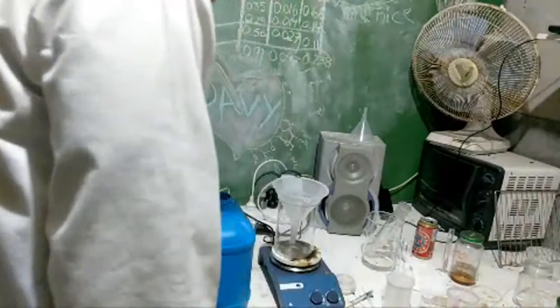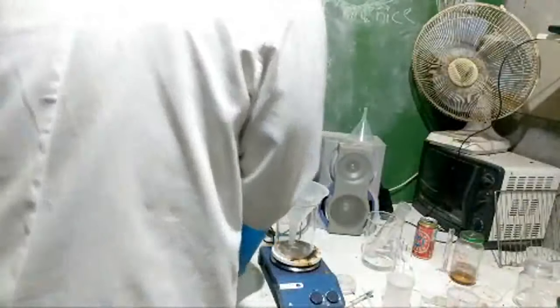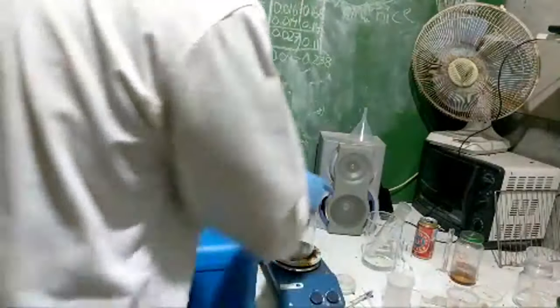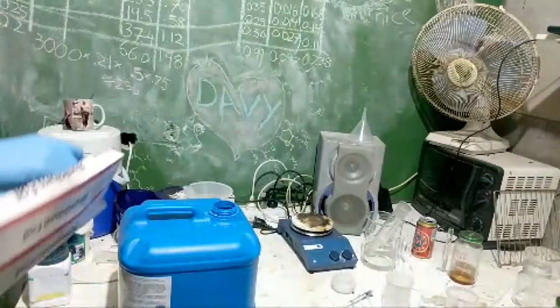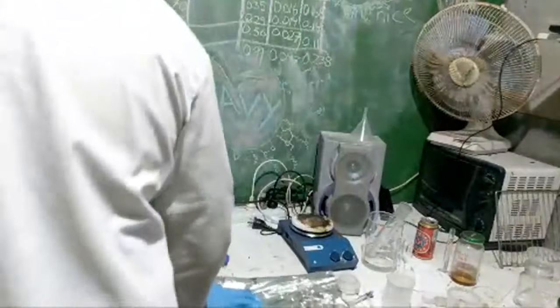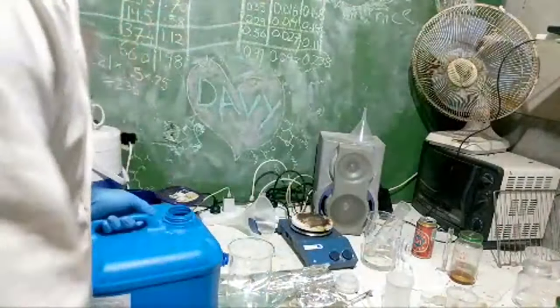Alright, let's try and pour this bleach. They've made it hard to pour. I think they've done that on purpose because you're not meant to pour it into beakers. You're meant to be pouring it into a swimming pool. So, they intentionally make it bad. I might just put down some foil, otherwise I might ruin this whole bench top.